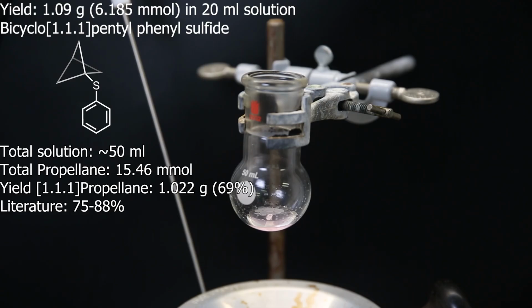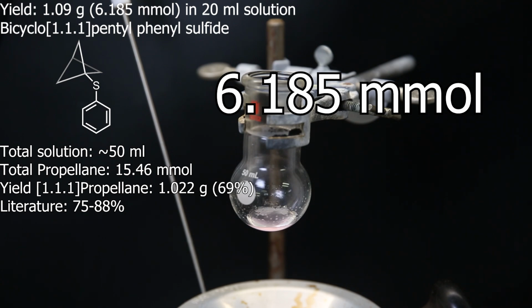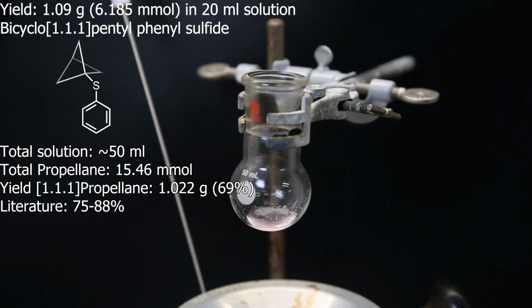I remove the stir bar, and the weight of the product turned out to be 1.09 grams, which is this amount of moles. So the same amount of propellane was in the 20 ml of solution. If we then calculate it to the total of 50 ml of solution that I had, that means that in the 50 ml there was 1.022 grams of 1,1,1 propellane, which is a yield of 69%. This is similar to the literature, where they achieved a yield between 75 and 88%.